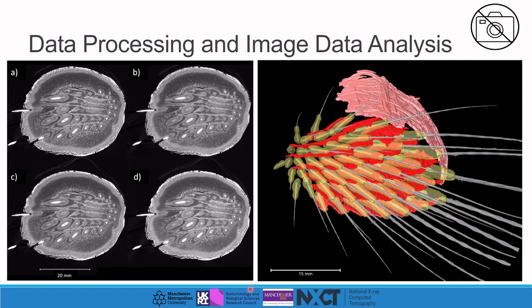Here is an example of a combined structure in 3D. So we have in white the whiskers, with the follicles in yellow separated by collagen sheets that create rows in the mystacial pads, and then in pink is one of the major muscle groups involved in the overall movement of the cheek itself. And you can see here the one-to-one of the yellow of the follicles can be seen here in the 2D cross-section, and the same, the white of the whiskers is the bright white centres of the follicles, and these sheet structures here in 2D are seen here in red in 3D.